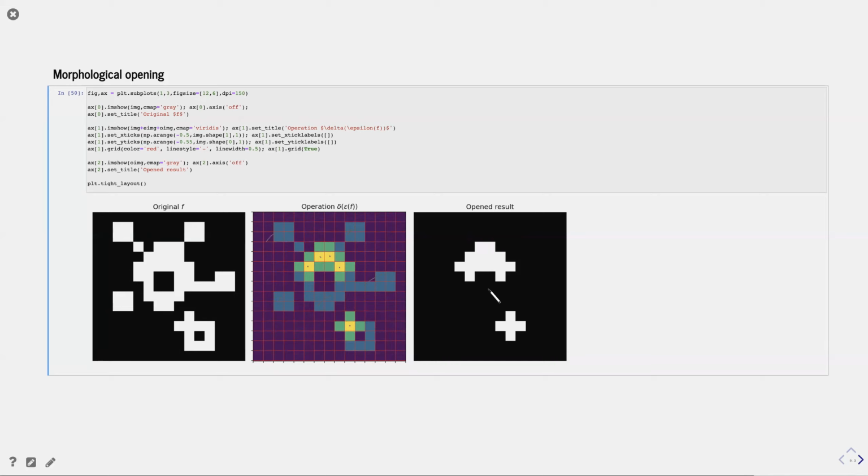The purpose of the opening is if you have false positives, then you can remove them, because the false positives are usually mostly just single pixels or a few pixels that you want to remove. Thinking back on the mitochondria example, it would probably require quite a large structure element to clean, but it would still work.